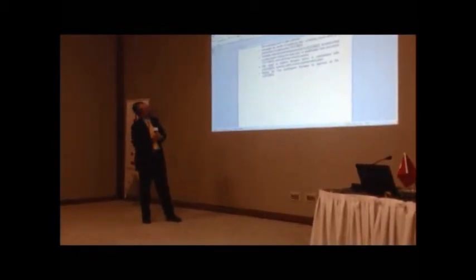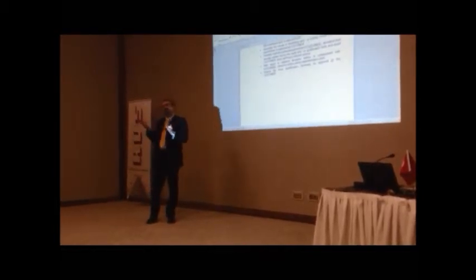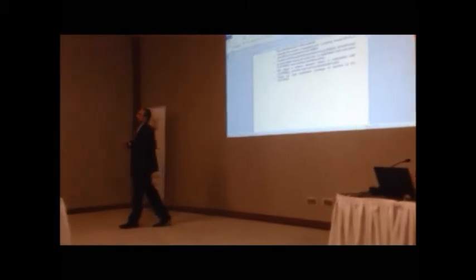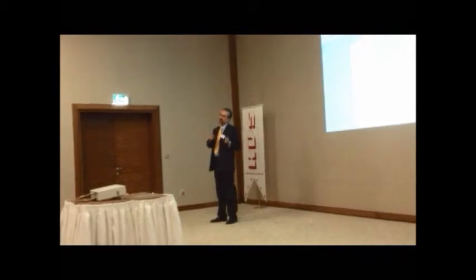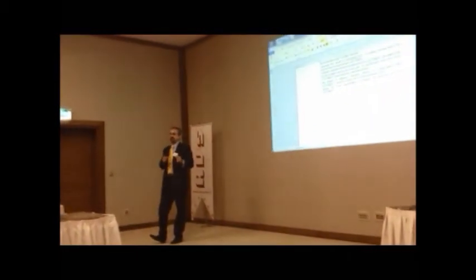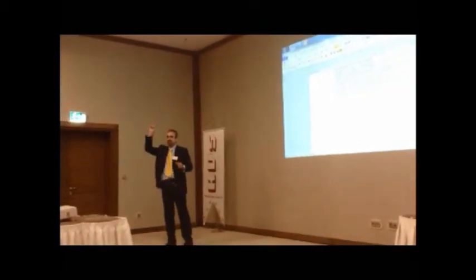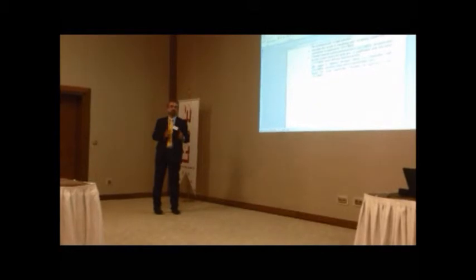This is another important point. Promptly notify the customer if there is something wrong. Not after one month, but during the performance of the validation. I mean, if I find 115 degrees instead of 121, immediately I go to the responsible person to say that there is something wrong and to put in the decision and the corrective action.